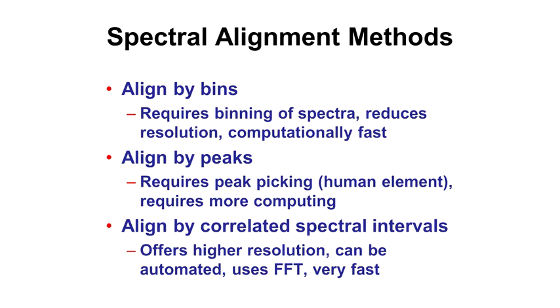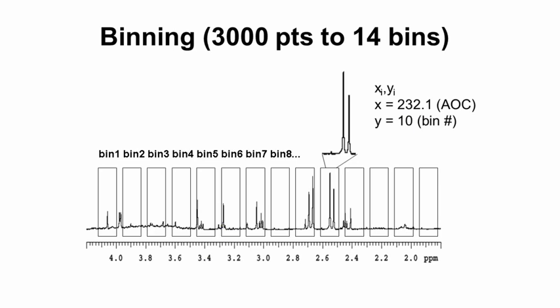It can be automated. It's also very fast. So we'll just talk about binning because it's a little more intuitive. And as I said, it was the very first technique that people used.